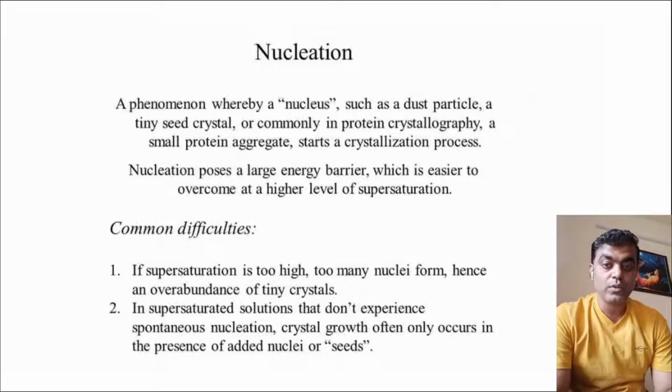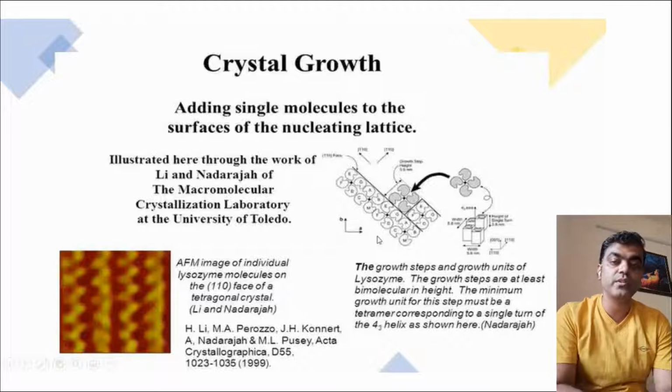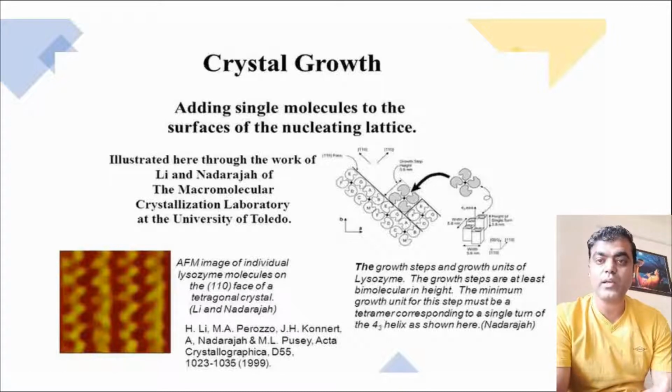So nucleation, supersaturation, and solvent, that is, how much solvent or the solubility of that protein, these things are very, very important when you are starting with your crystallization. Another very important point, keeping in line with the previous, like the growth I was talking of. So this is a small example. You see here in this example, this has been done at the University of Toledo, where they have shown that unit seed growth of the crystal may not always be the true case with all crystal growth development processes.